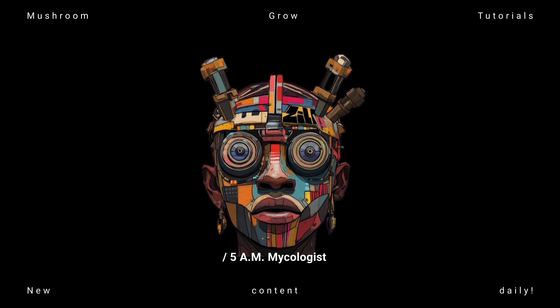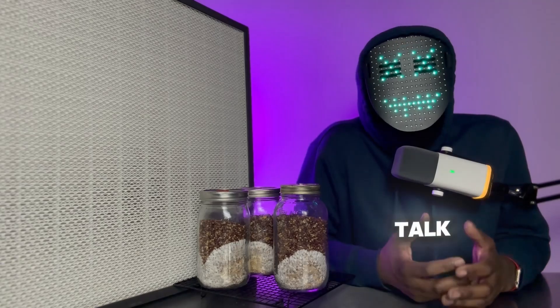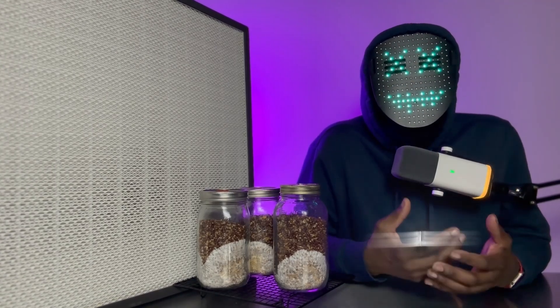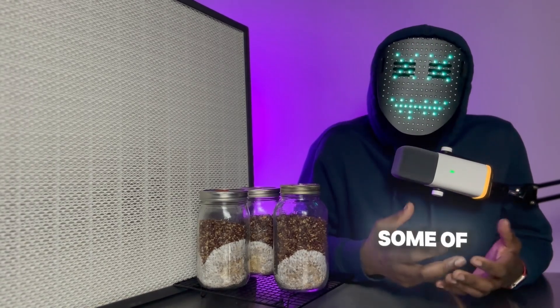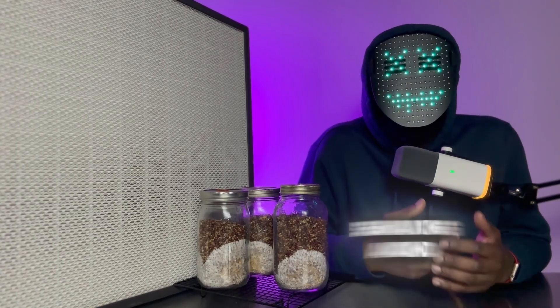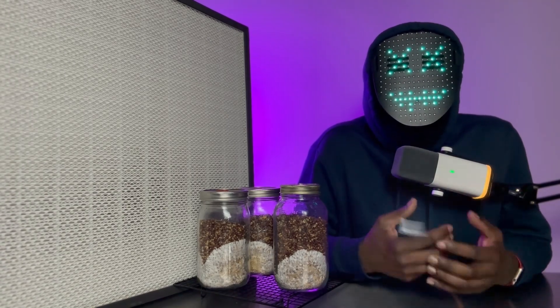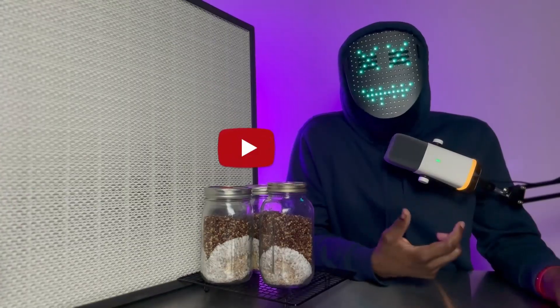There are numerous videos on YouTube that talk about and show you how to break and shake your grain jars when you are generating grain spawn. While some of those videos are helpful, I would like to explain the process of breaking, shaking, and redistributing your myceliated grain in a way that I would like a 5AM mycologist to understand it.